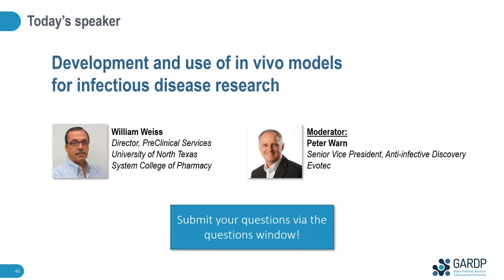In terms of two thighs versus one and how you handle the data, I've seen people that will infect both thighs with the same organism, do a couple of mice and say they now have an N of 6-8, where they really only had 3 or 4 animals. I'm in favor of not doing both thighs.